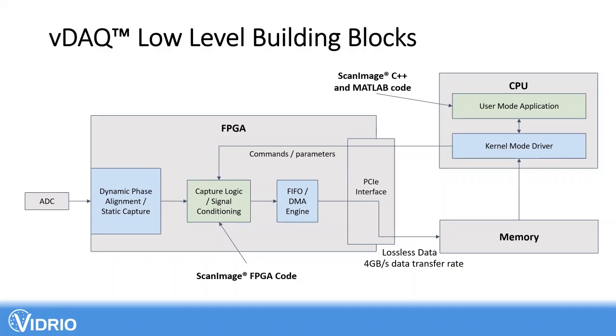It wouldn't be available through the MATLAB interface since the C++ backend of ScanImage intercepts the data first, just to make sure that the performance is adequate and all the data gets logged to disk. And in the ScanImage architecture, not all the frames get processed through MATLAB. So if something needs to operate down to the level of partial frames, it would have to be in C++ or in FPGA. But right now, we don't have access to the C++ portion of the code, right? So if we need to implement something. That's correct.